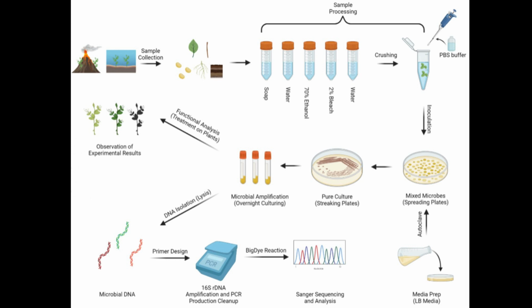After this, the next step was to incubate the bacteria in tubes that contained nitrate broth and then centrifuging it to separate the supernatant and the biomass from one another. Then, 1 to 2 drops of 0.8 solution of sulfanilic acid and alpha-naphthylamine solution were mixed. This tested to see if the bacterial colonies had nitrate reductase activity of the isolates, showing if they possessed the ability to produce silver nanoparticles. If a pink color appeared, then the test was positive. The samples that tested positive were VQ1, 2, 3, 4, 7, and 9.